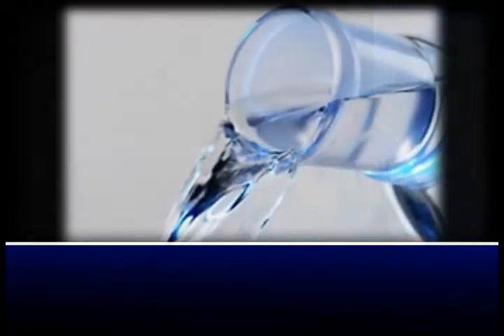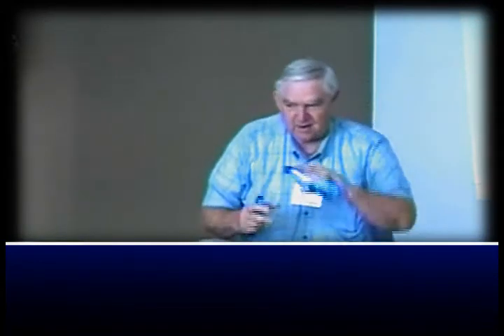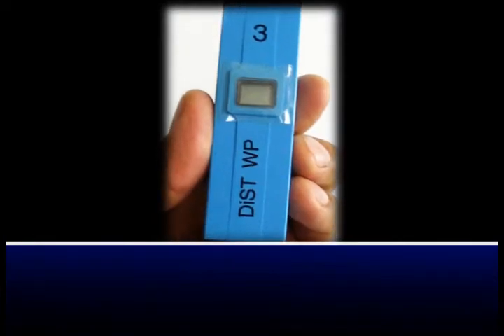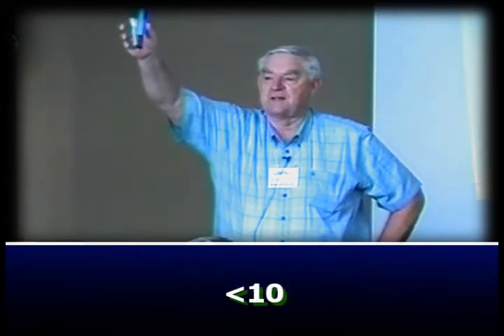The next thing you do is acquire some water and put water in this cup to the level of the soil in the other cup — equal by volume. It isn't that critical to be exact. Then you put water in this cup up to the level of the soil. Remember, this is very critical: you measure the conductivity of this water, because you want water that reads less than 10 on your conductivity meter.